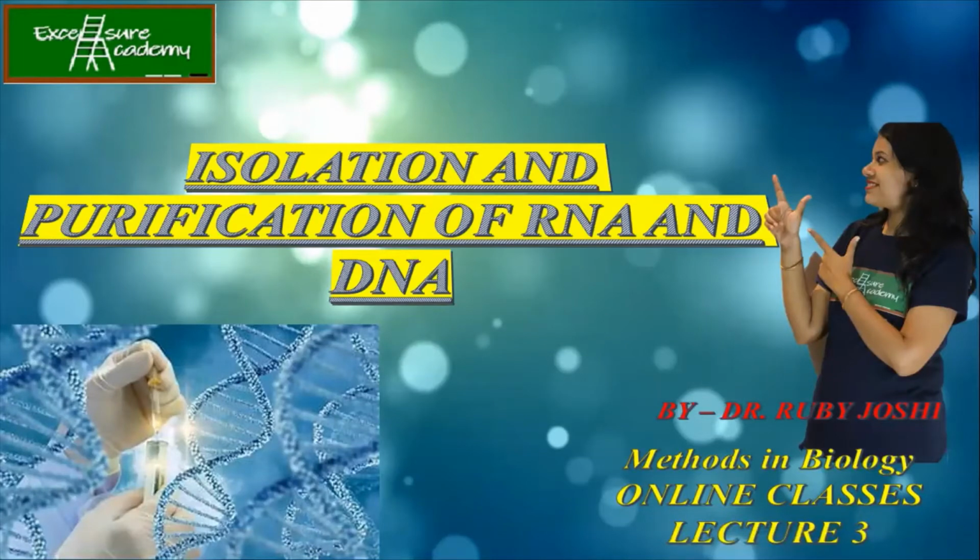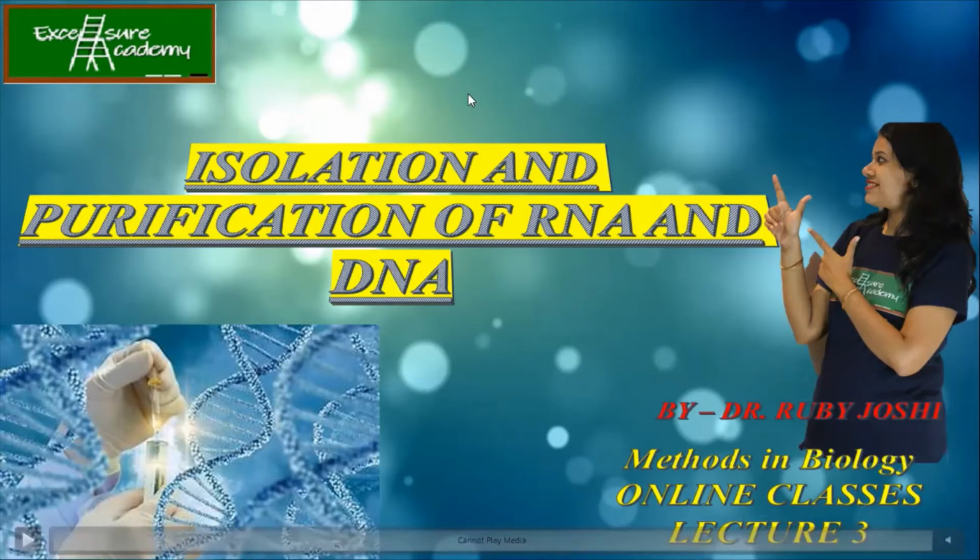So guys, till now we have discussed how we can start the isolation and purification of RNA and DNA, right? So till now what we have discussed is where exactly to start. Okay, so we know how to start now, and what we are discussing right now is all the conventional method.